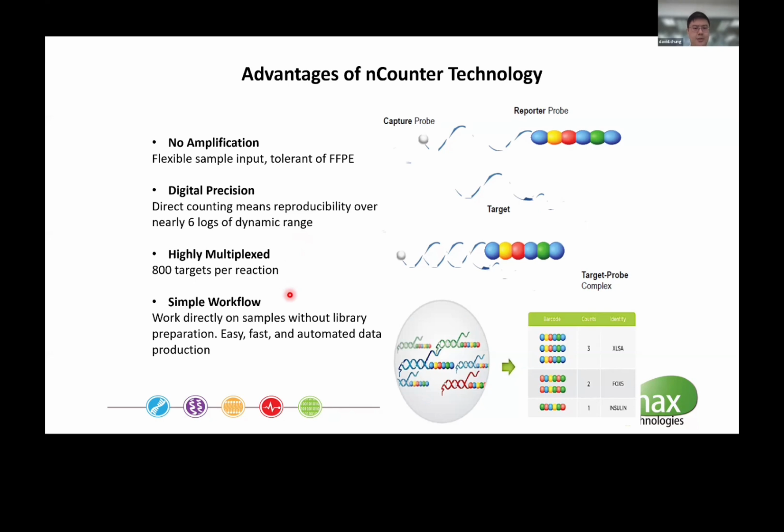Technically, it's just only 4 pipetting steps. Basically, just create a mix of the probe, add it to a sample tube, put in the total RNA, lastly put in the capture probe to each well, and then put it in the thermocycler for overnight incubation. Everything else on the next day is just automated. So the whole flow will just take around 1.5 days.